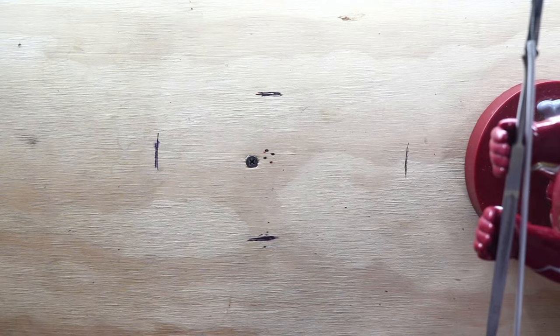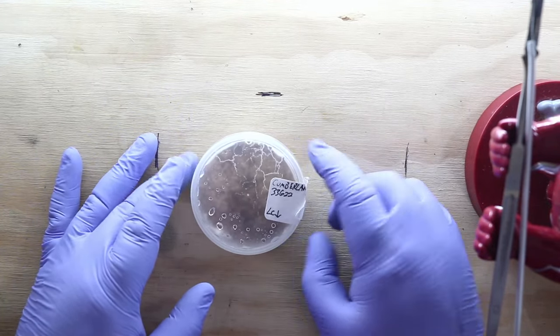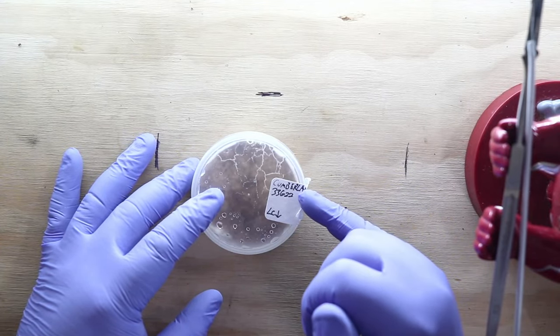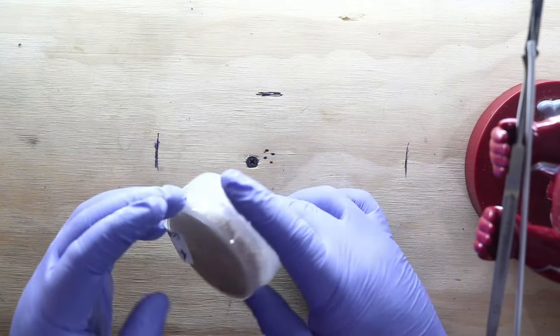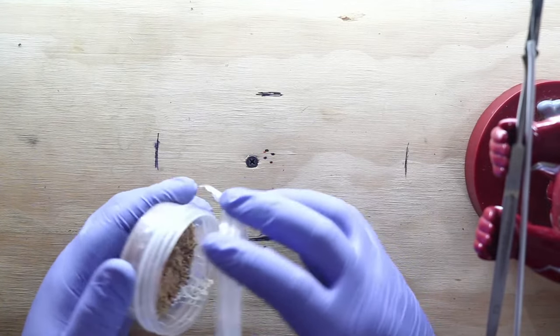You're okay, well, let's talk about cleaning up dishes then a little bit. Here's one of my favorite ways to do it. This is our Cumberland oyster. This is an older dish. You can see it was done on day 336 of the year 22. So this is quite old, but I left it around as an example that I can show people. So I actually don't even mind if we open it up.